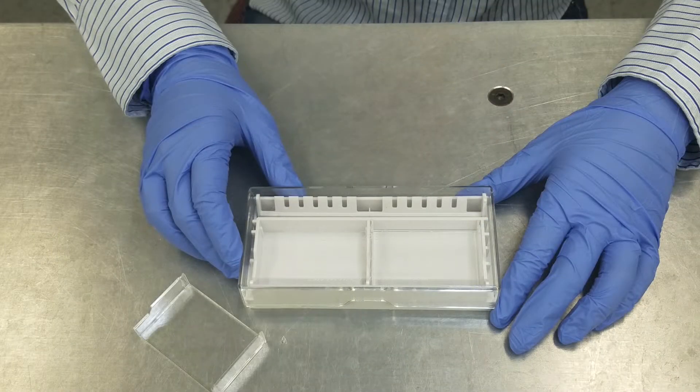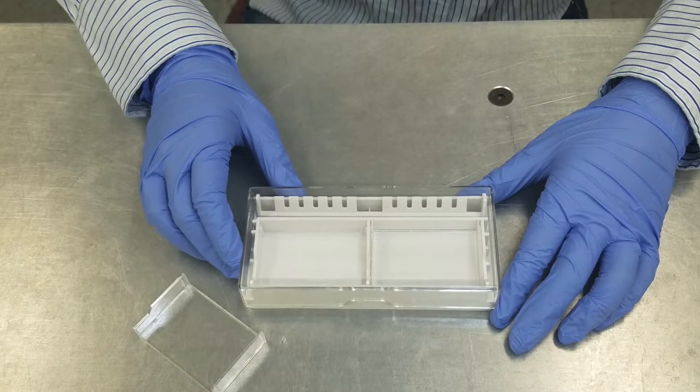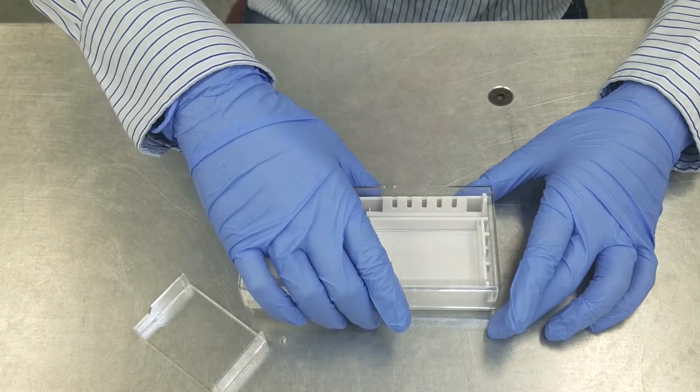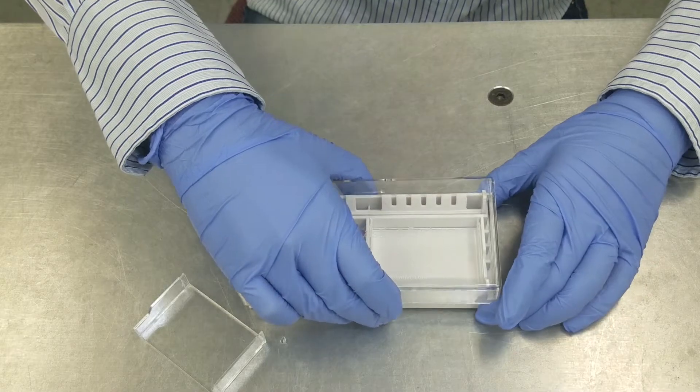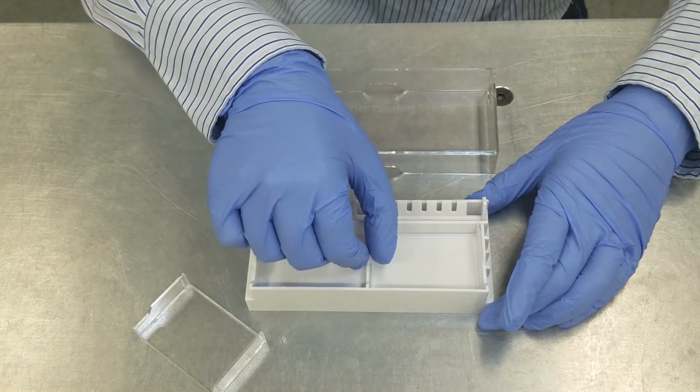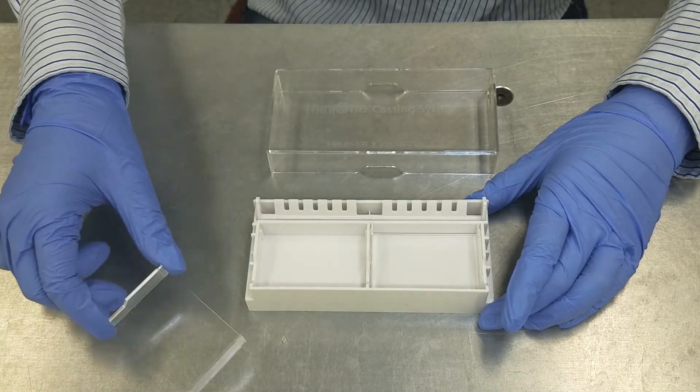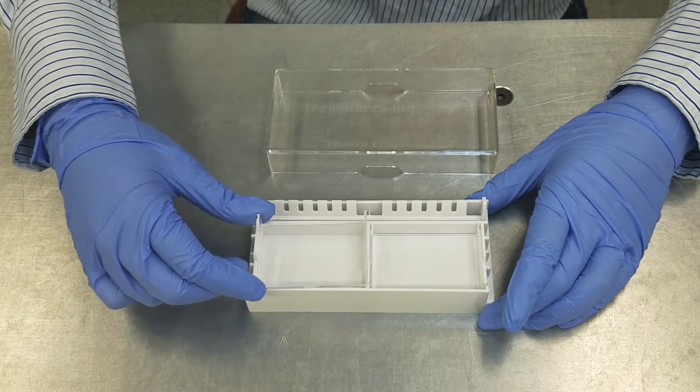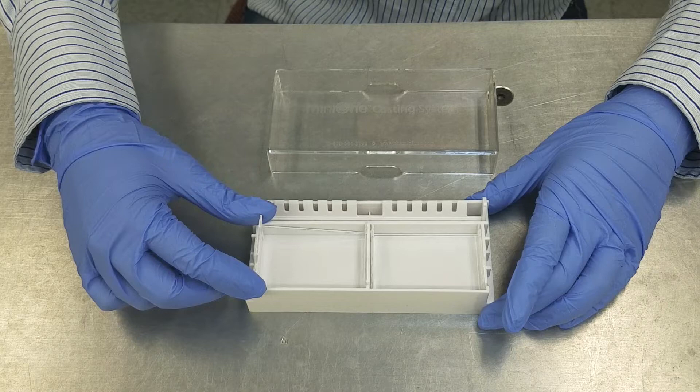The gel casting stand is designed to allow for up to 2 gels to be made at the same time. Remove the clear hard plastic lid and check that the acrylic gel casting trays are in the stand. If not, place the trays into the stand. They should fit smoothly in only one orientation and should not be forced.